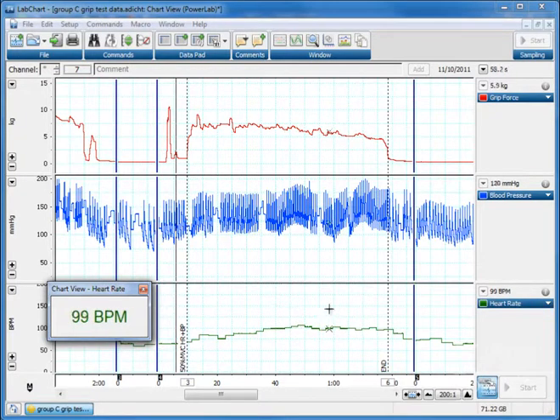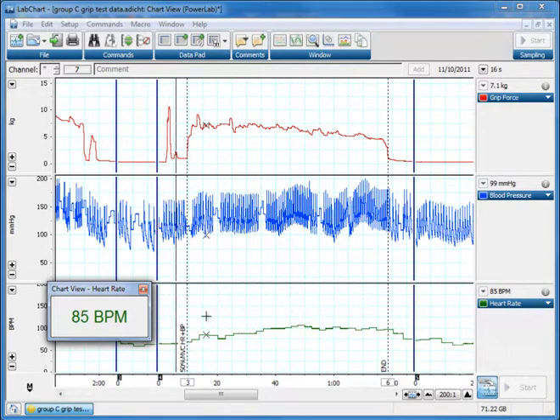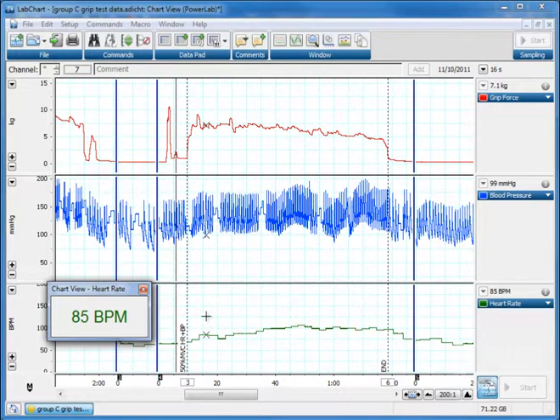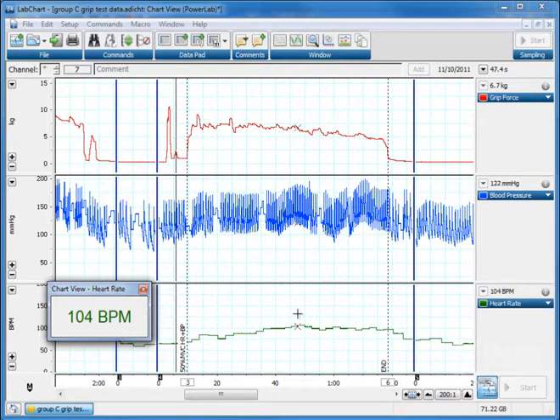This is quite useful just to look through data and have a little browse, but if you were going to be using this for writing data down, it does still involve writing data down with a pen and pencil or paper and pad and trying to then transcribe this into Excel or another program for analysis. This can be a little bit tedious, it can be quite time-consuming.